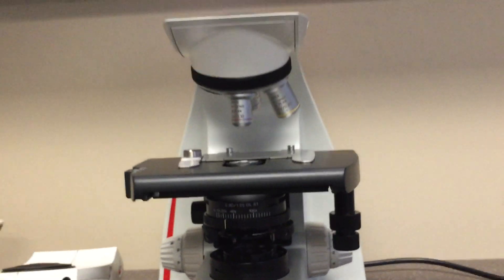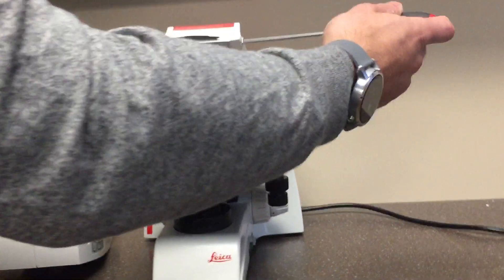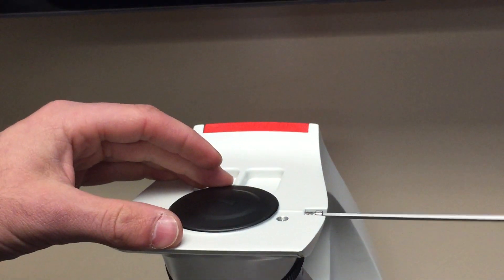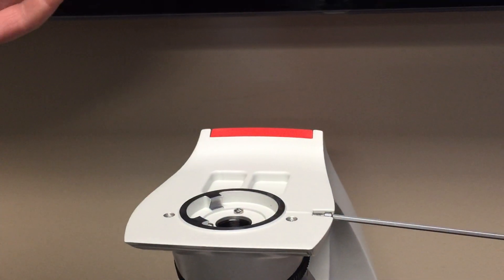Once that is complete, the first step is to remove the cap on the top of the microscope using the included three millimeter wrench. Simply loosen the screw and remove the cap.